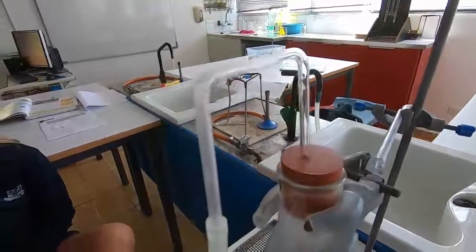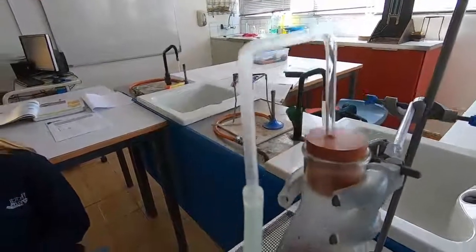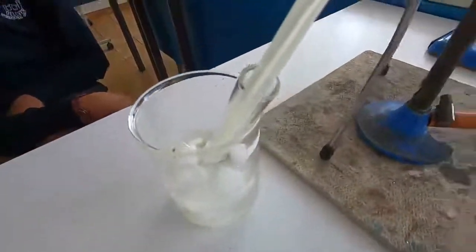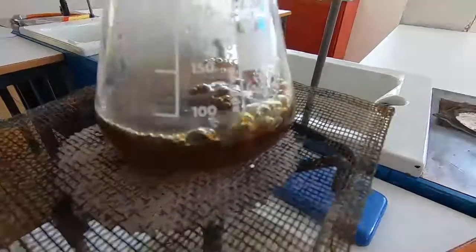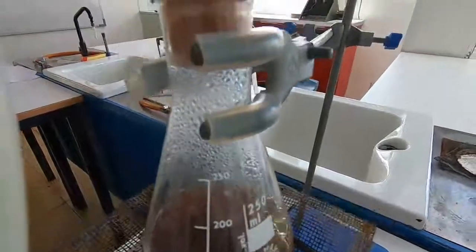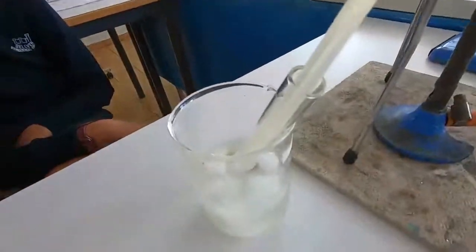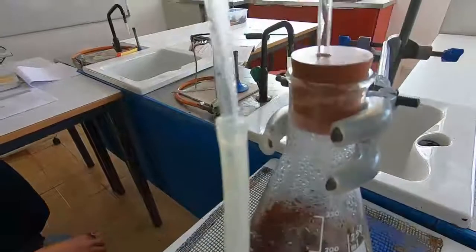The vapours will be collected in the test tube which is cooled by iced water. The cola mixture is now beginning to boil and the vapour is rising up through the tubes, condensing a little bit in the tube. Then as it goes down into the iced water it will begin to condense and we'll be able to collect it.